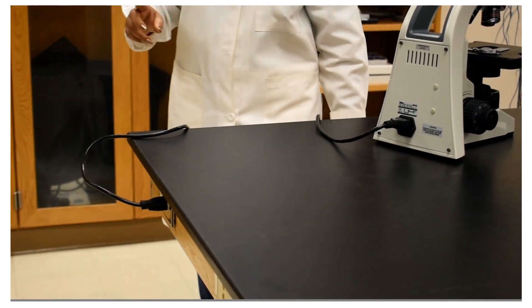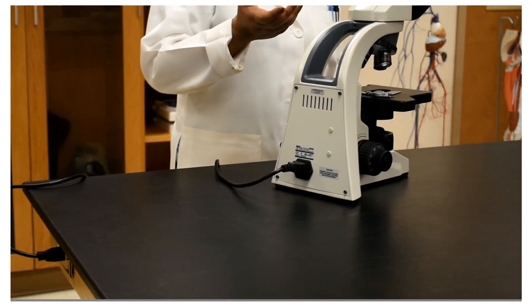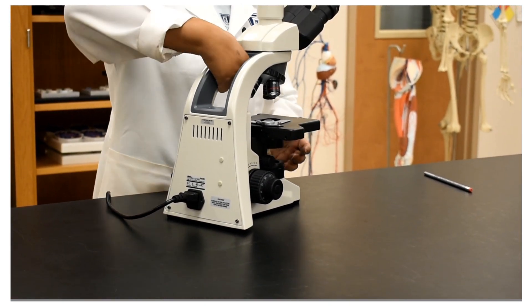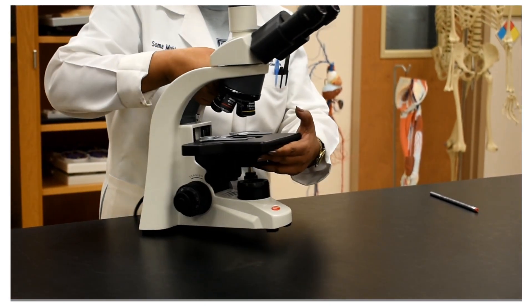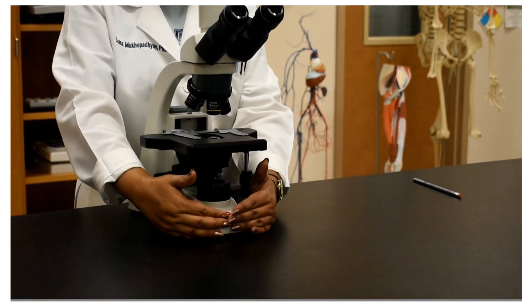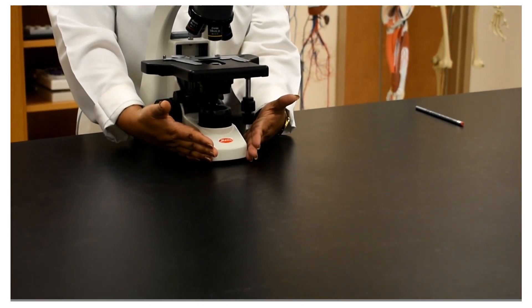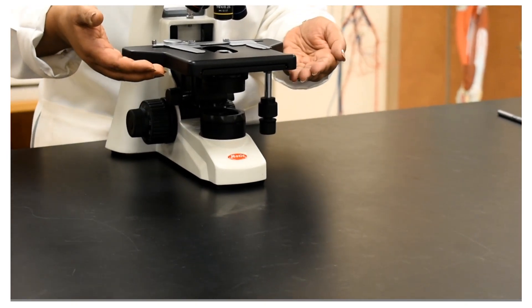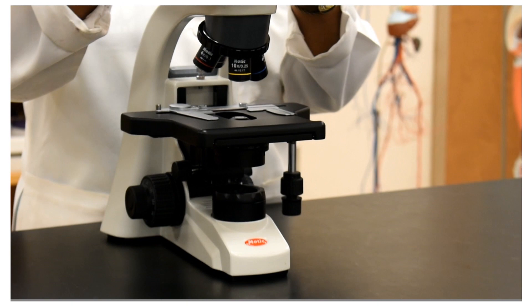We need to plug it in because we need the light source to see the object we would like to view using the microscope. We will start with the base — this is the support of the microscope — and then gradually go through the structure upwards.